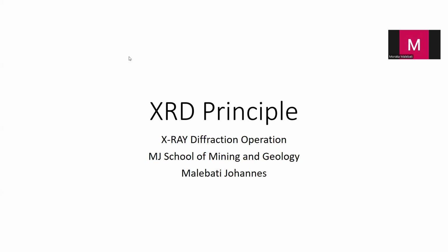In today's lesson, we are dealing with the X-ray diffraction principles. We're going to be looking at how the X-ray diffraction machine operates and specifically looking into Bragg's law.